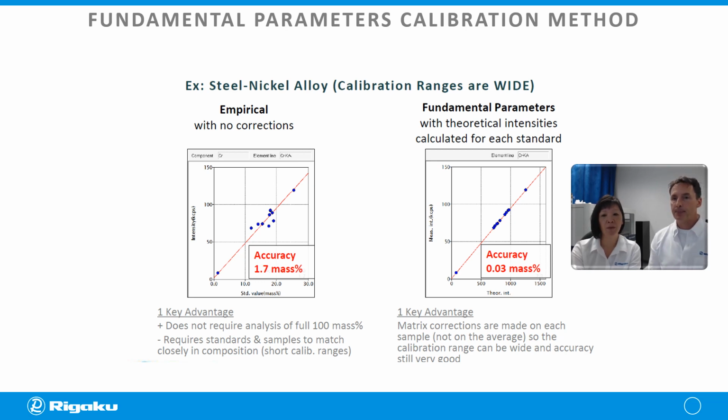Now, through the software, if you build it with one method, you can change it to another method by just a click of a button without reanalyzing or recollecting anything. So I really like the software in the sense that you can do that without basically re-injection, if you're in chromatography. It does all this for you. So although it seems kind of complex, it's not. And you, again, always have the option to say, hey, my formulation is constant. I'm just going to analyze for those analytes and do a calibration strictly empirical, and that's the easiest way to operate.